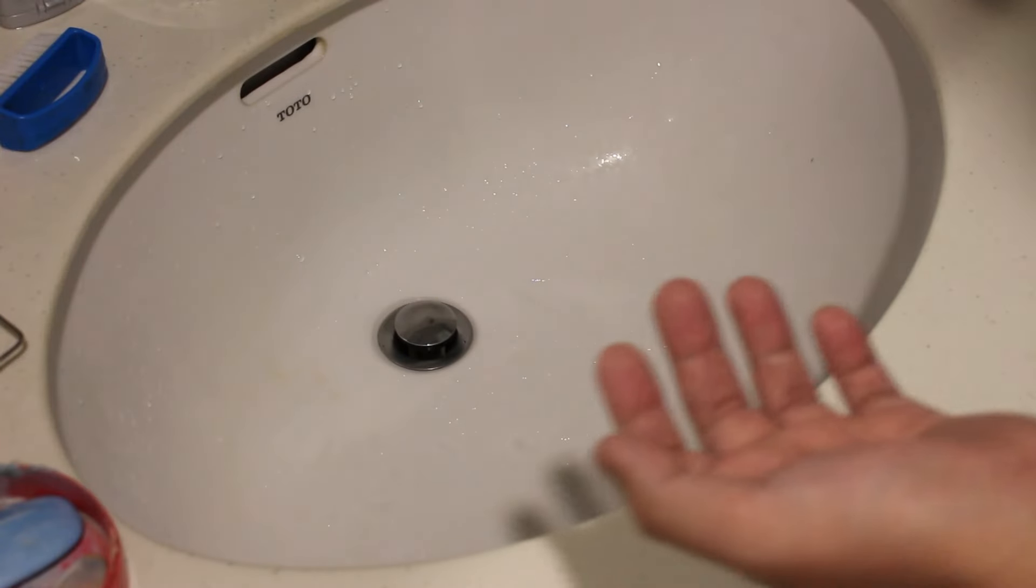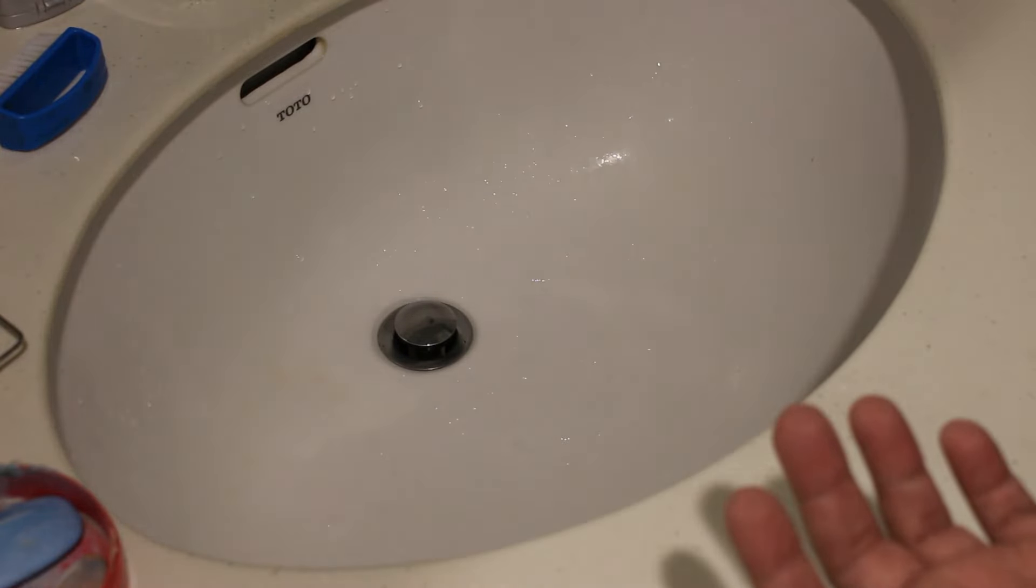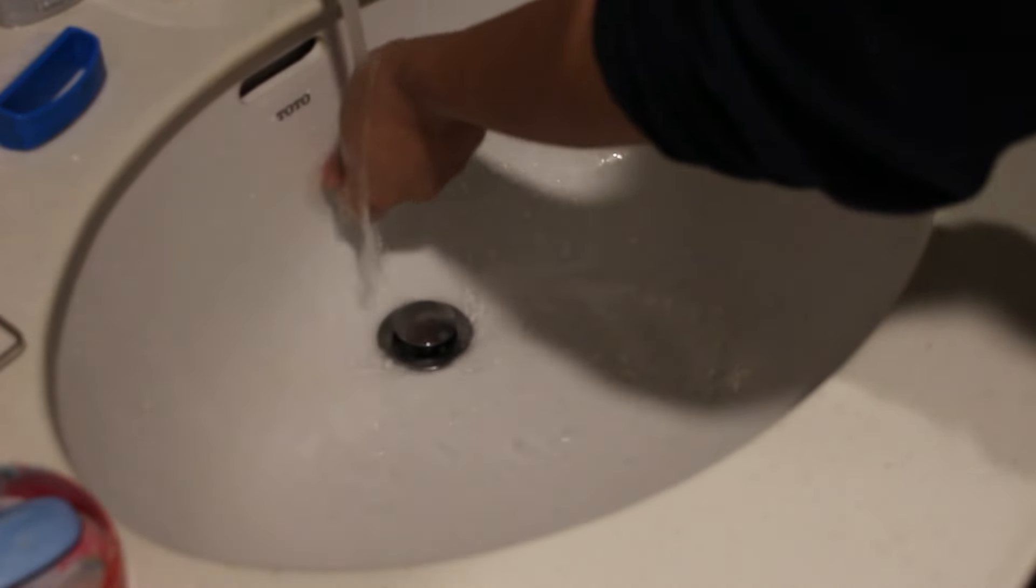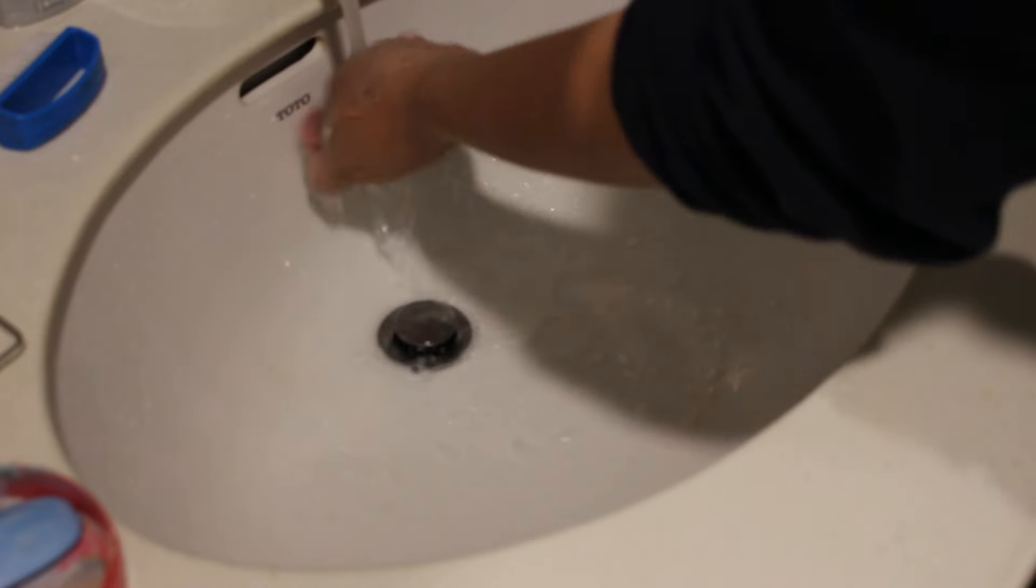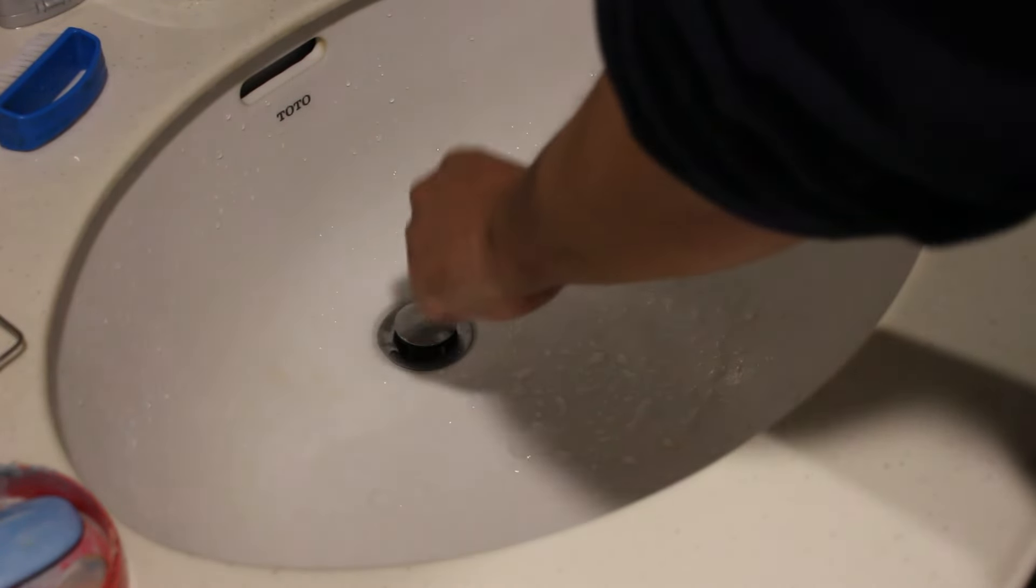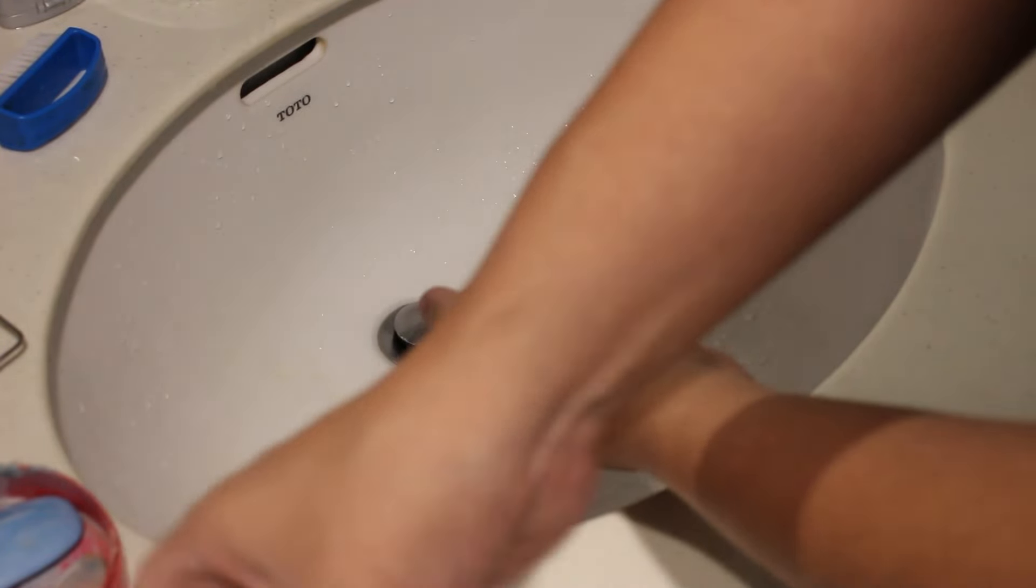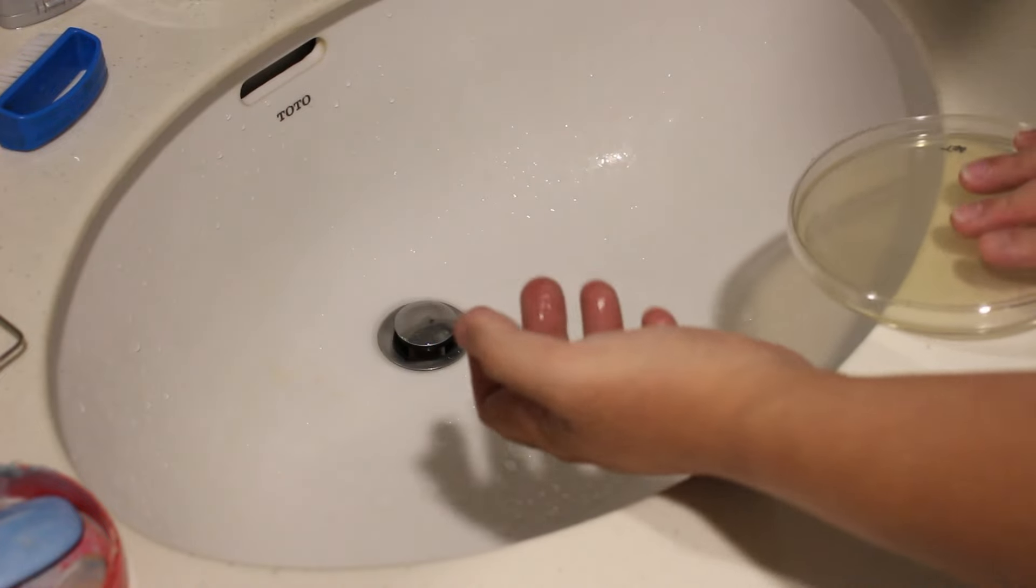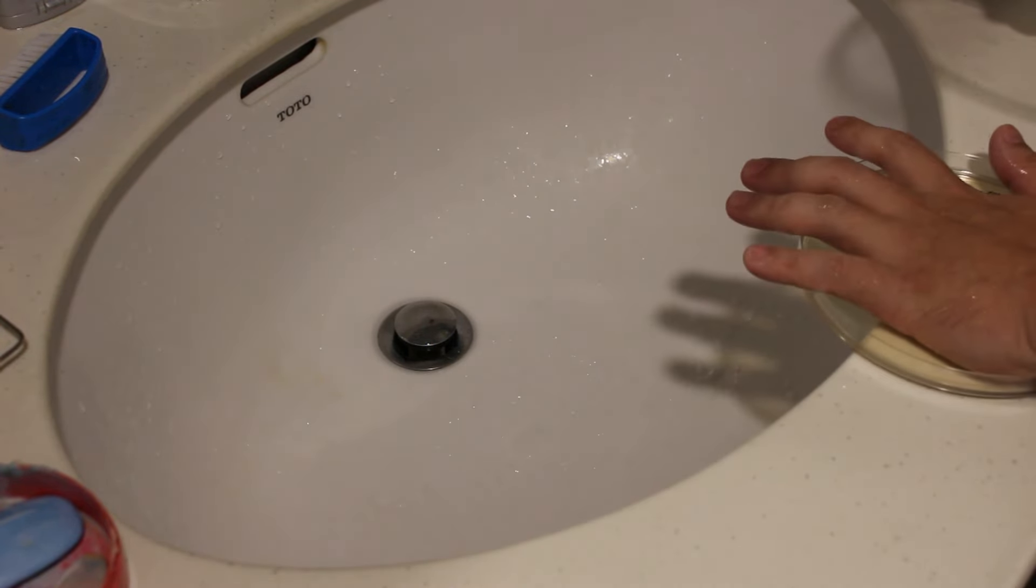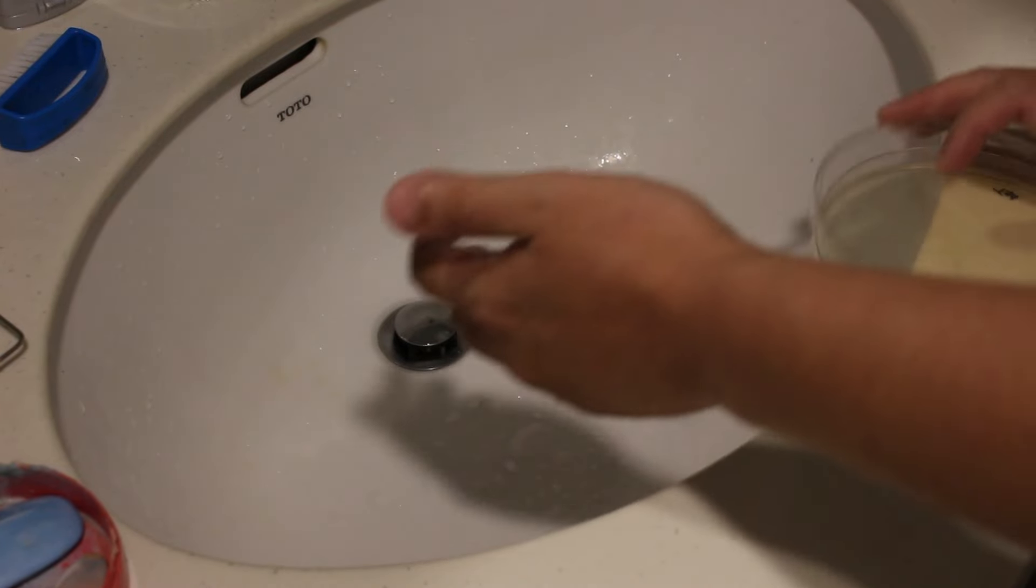So after seeing all those results, although the antibacterial soap performed a little bit better than the normal soap, I think whether normal soap or antibacterial soap, the way of washing is the main factor that is going to decide if the hand is clean or not. Although you still have to use soap though.